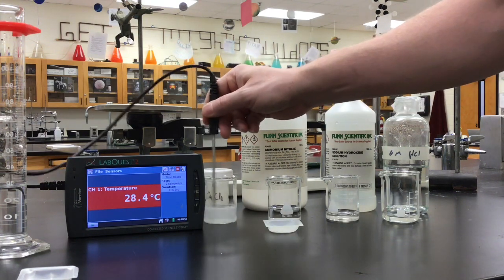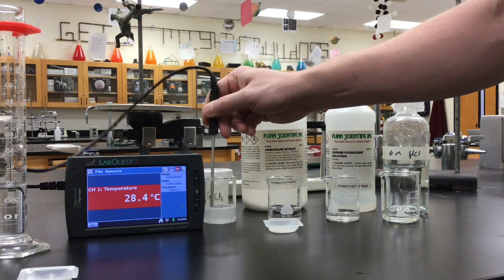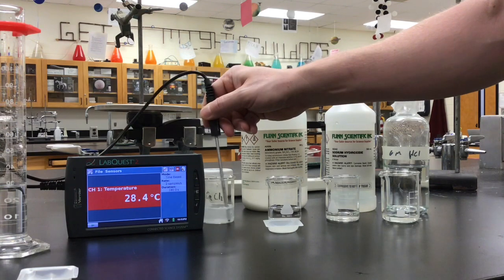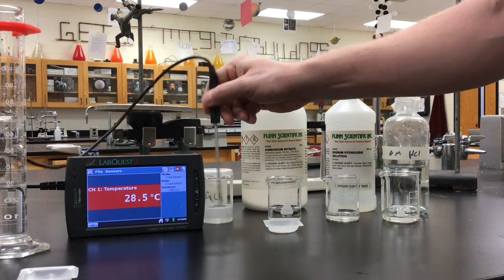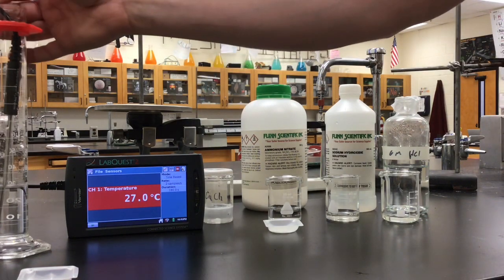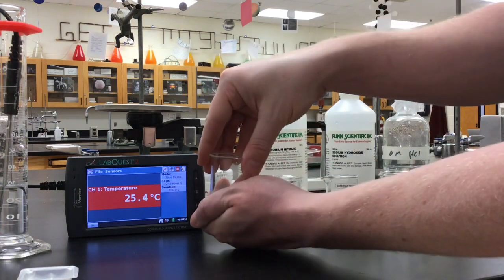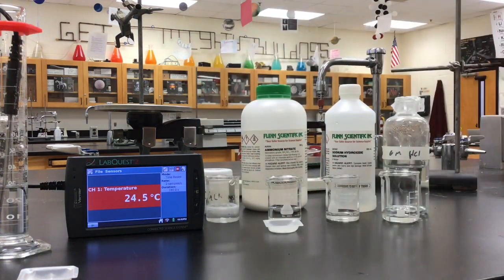There we go. It's pretty much dissolved now at this point. We went from about 24 degrees initial to about 28.5 degrees for the final temperature. And if we hold this beaker in our hand, it feels a little bit warm. So the temperature there went up.